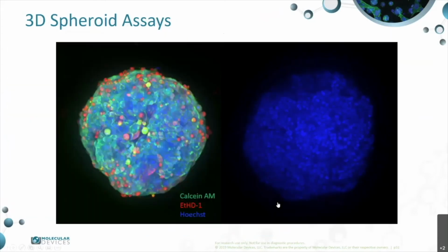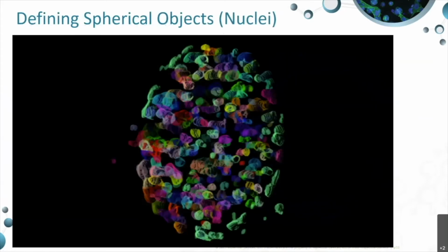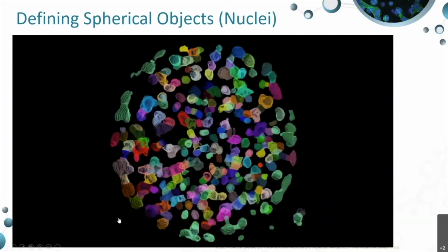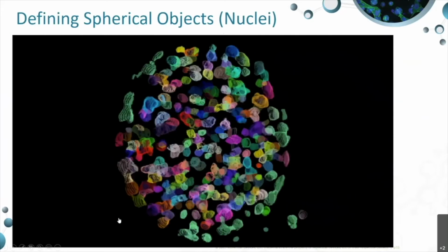So you can analyze individual images or a projection image, like in this case, this is a maximum projection. And those cells are stained with Hoechst nuclear stain, also viability stains calcein AM and ethidium homodimer for dead cells. And then you proceed with analysis, which allows reconstitution of these structures and cells in a volume, and also provides a number which could be evaluated.